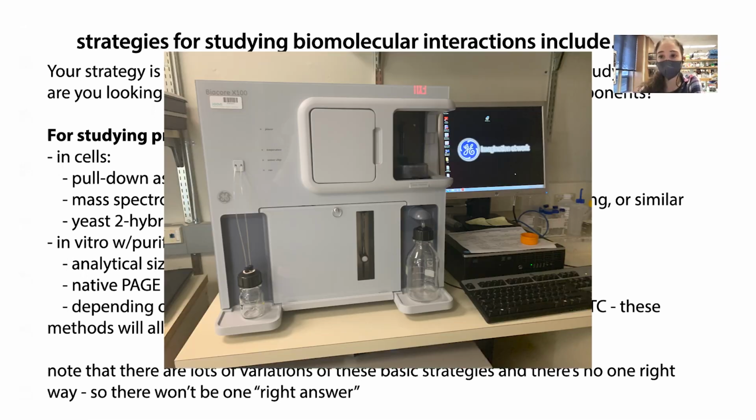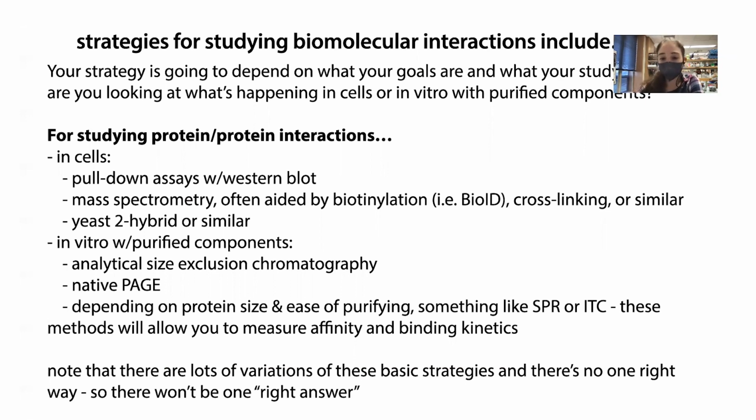You also can tag your protein and attach the protein. So there are different things that you can do. It might take troubleshooting, and some of the chips you can reuse, but there are various complications, various details, and a lot of different stuff. But SPR can be a really great technique. I just haven't used it that much.